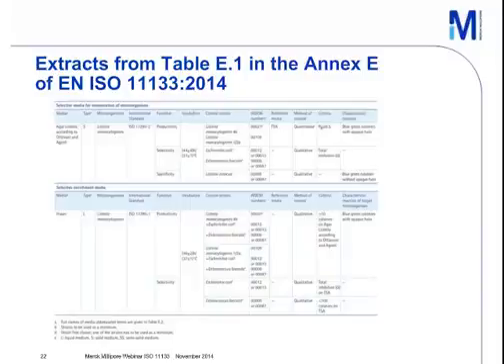You will see here also the numbers given only by the numbers of WDCM. And the reference medium for productivity testing is here the tryptic soy agar. The method of control is quantitative for productivity, if this medium is used for quantitative testing. Selectivity and specificity can be used with the qualitative method of control. Also the criteria and the characteristic reaction for this medium is given.